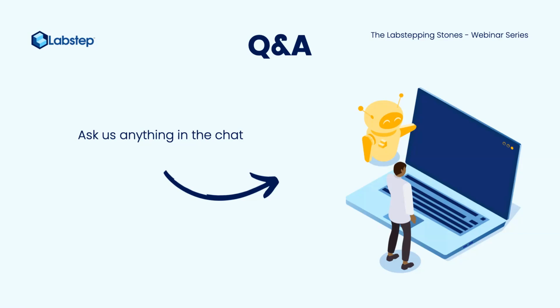We can see that you can track lineage using inventory. Can we find some more information out about that? Yeah, so we'll actually be hosting the third part of the Labstep Way, where we will be touching on lineage tracking, the device client, and order management. So that will be for next time.